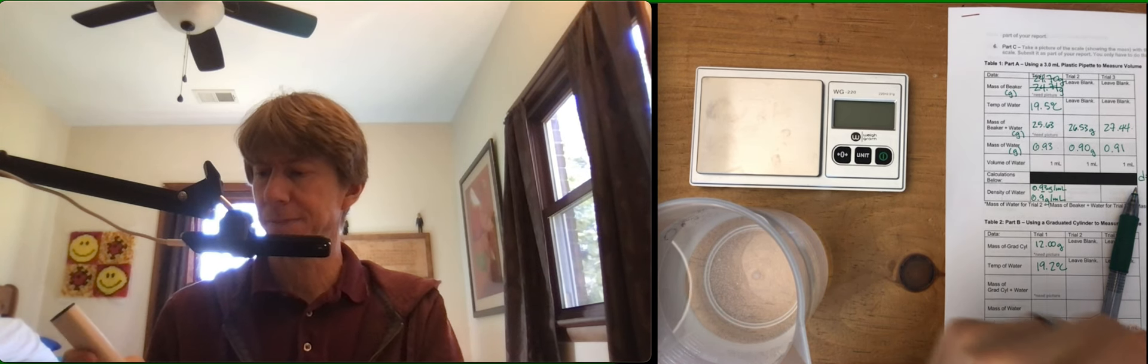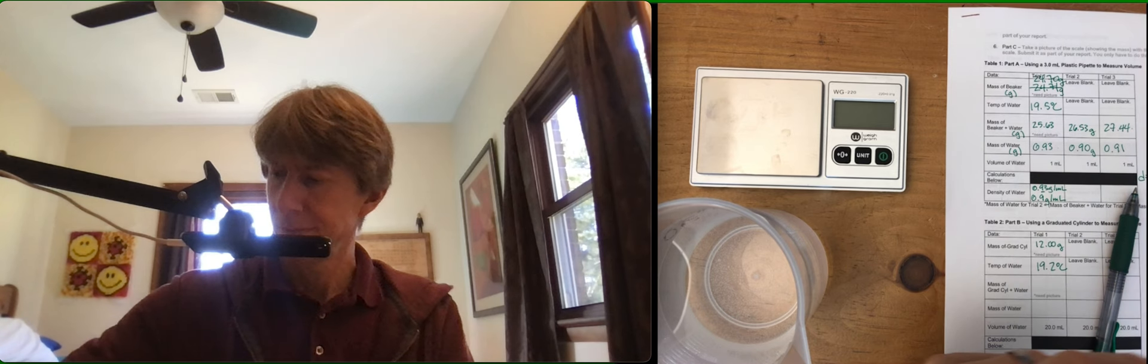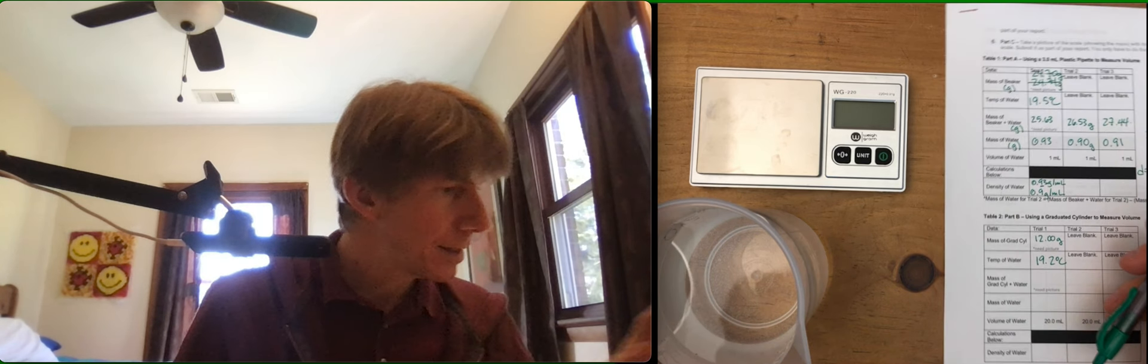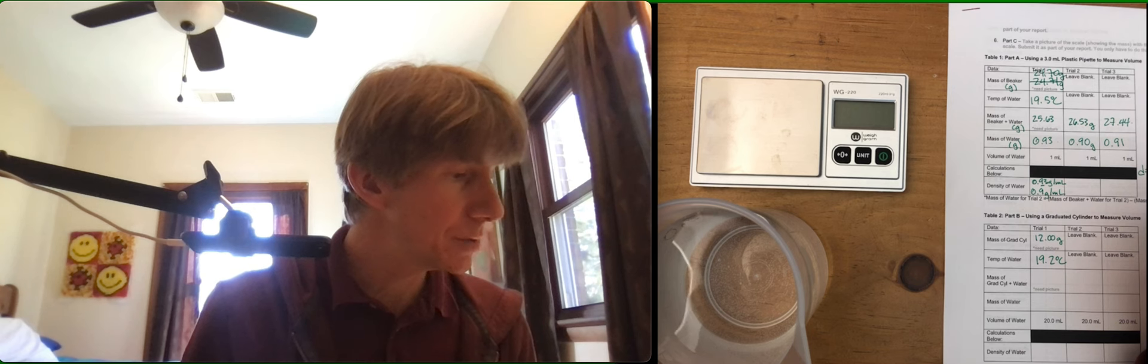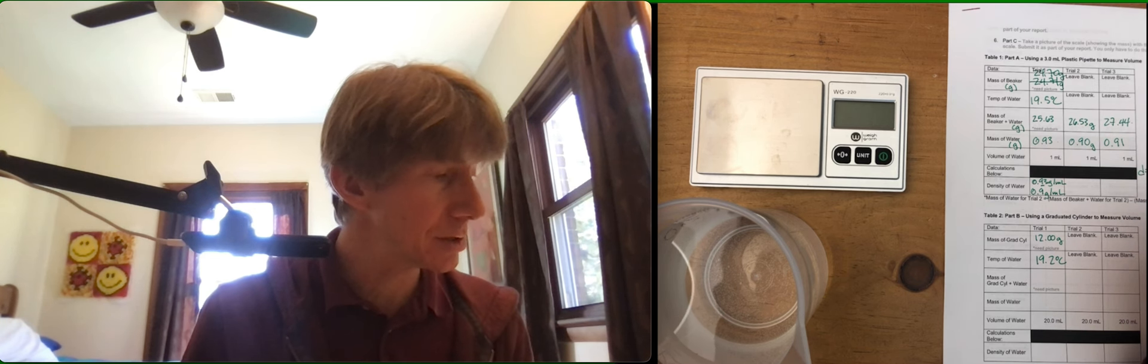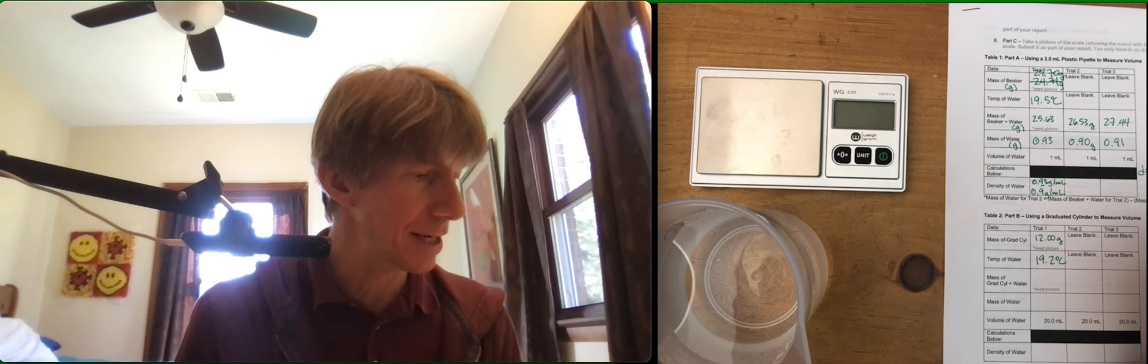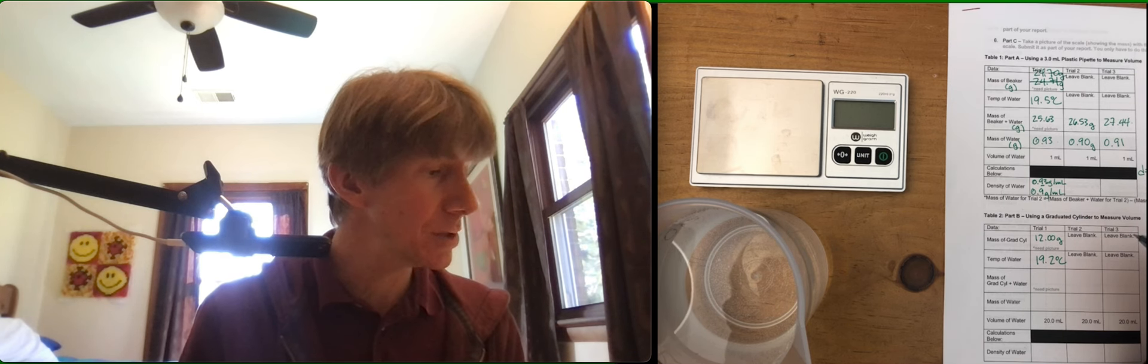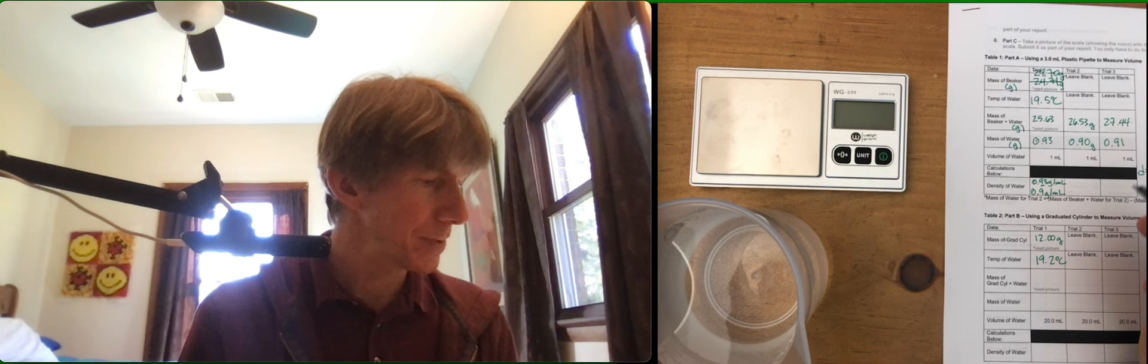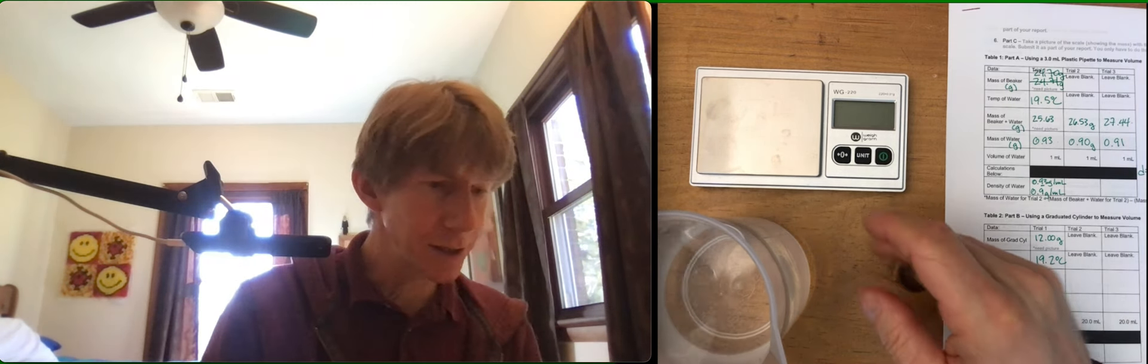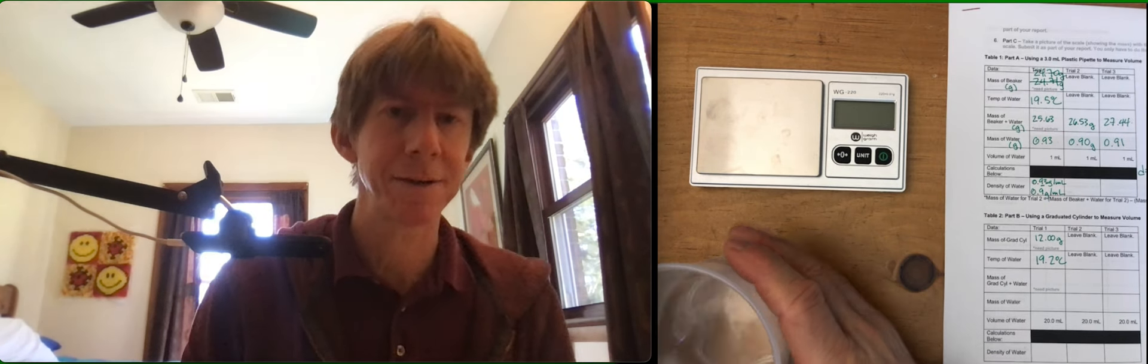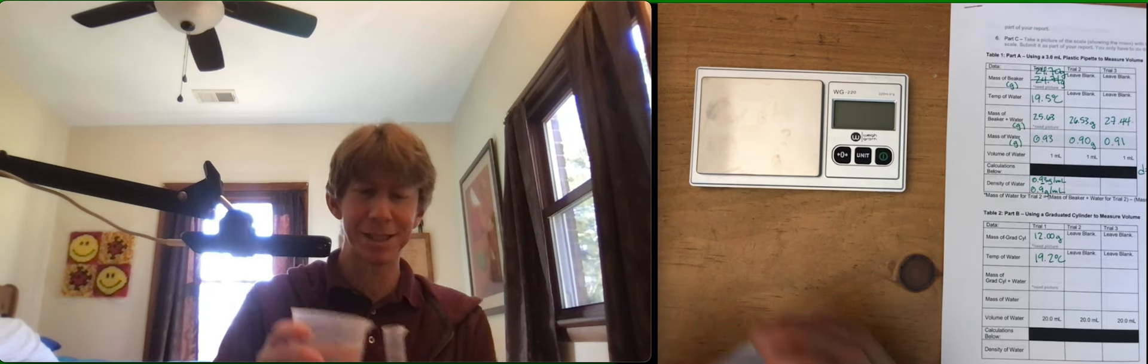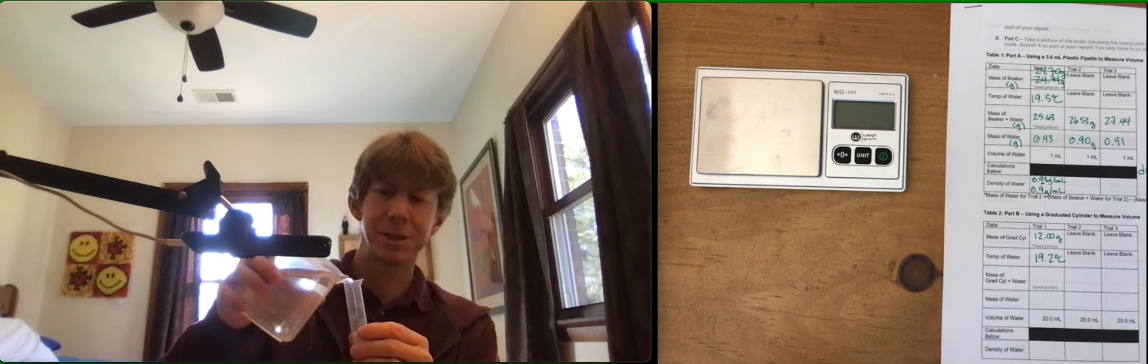Measure out 20 milliliters of the room temperature distilled water. Use droplets from the pipette to get the volume of water as close to the 20.0 milliliter line as possible. Your eyes should be at the level of the liquid surface in the graduated cylinder. I'm going to do this a little farther away from my scale and computer, so I'm going to pour it in.